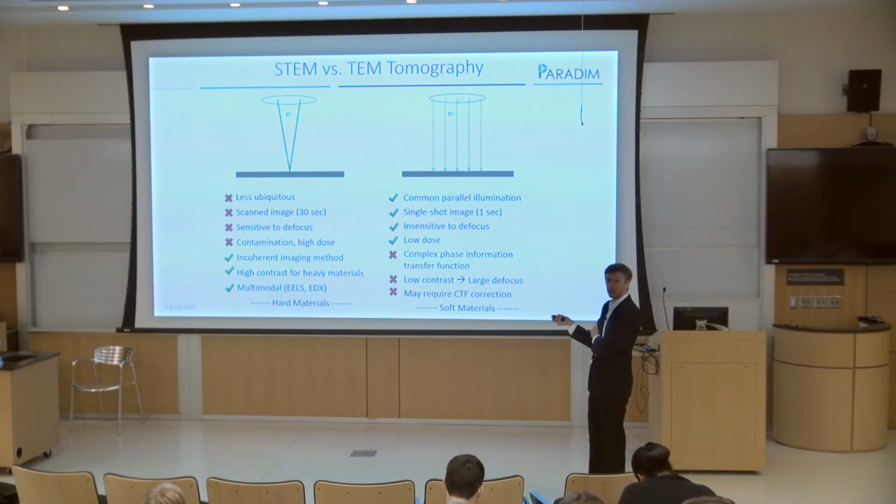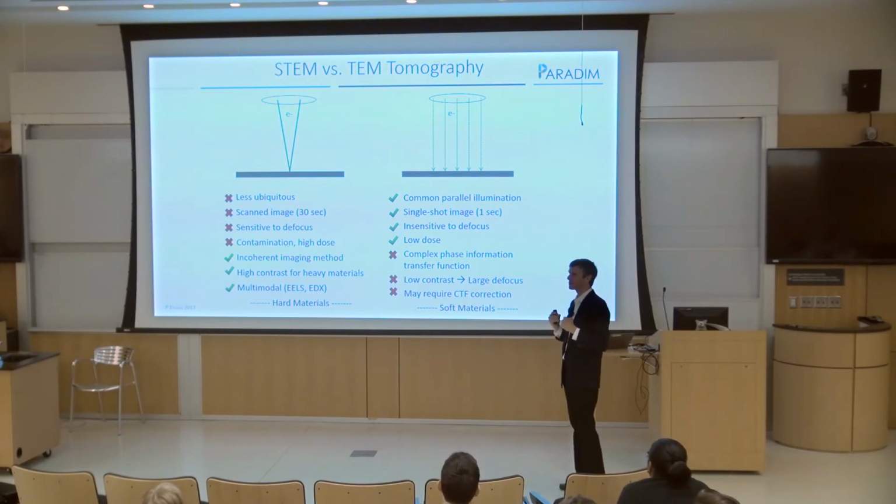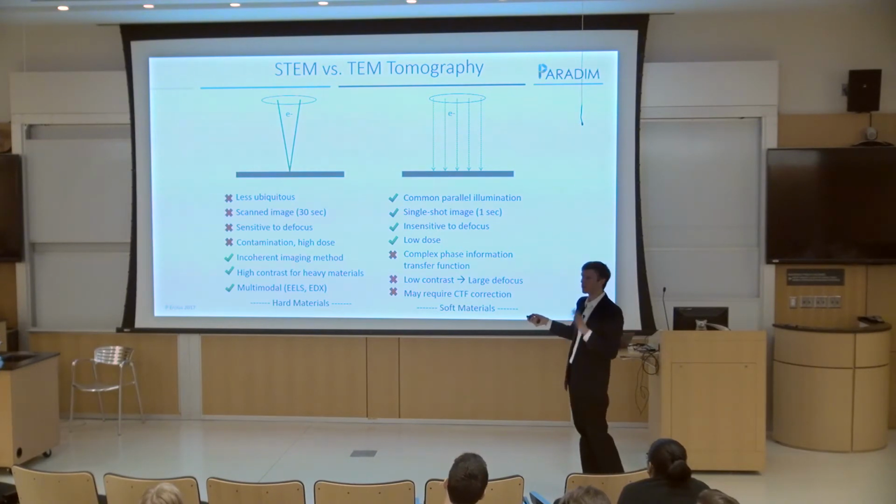It's very sensitive to defocus. If you're a little bit out of focus, generally it's not as sharp of an image. And there's different scales to that. There's contamination also. That's the worst thing in STEM. It ruins so many experiments. And so if you start seeing contamination in a tilt series, just give up. That's it. I mean, you can have a little bit of it, but if it's really big, just start over. Try to get rid of that contamination, because that builds up over time. Your images at the high tilts get much, much worse, and your 3D reconstruction is just significantly worse. Okay? There are some things you can do to kind of get rid of this, but getting rid of it and solving the source is much better than trying to solve it afterwards.